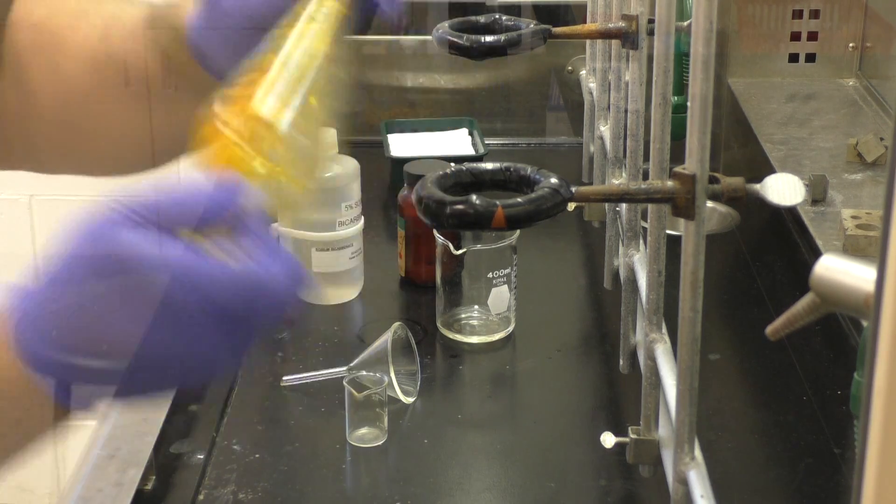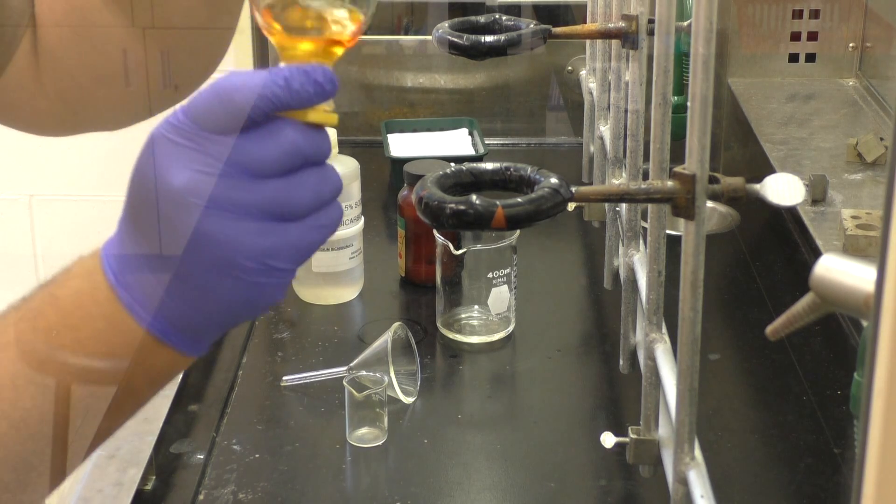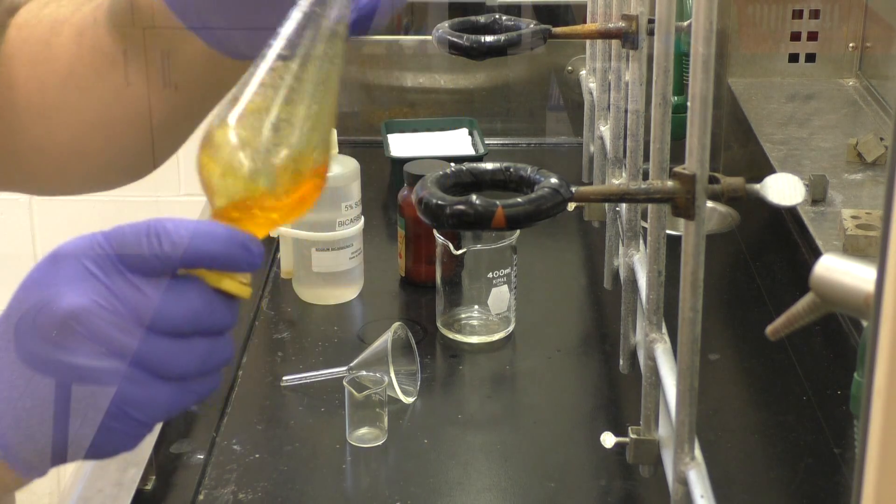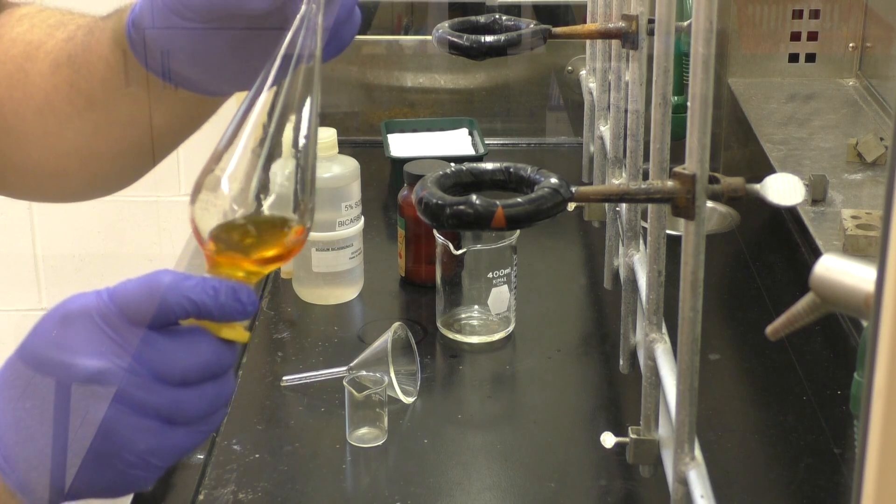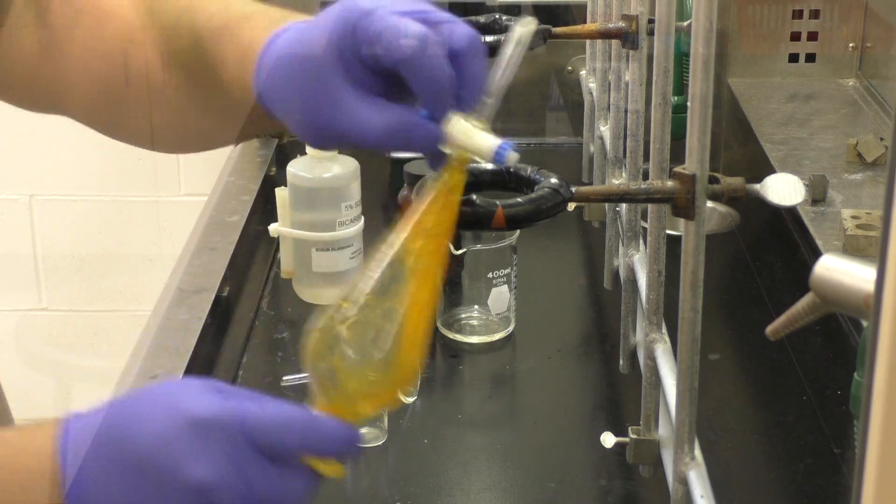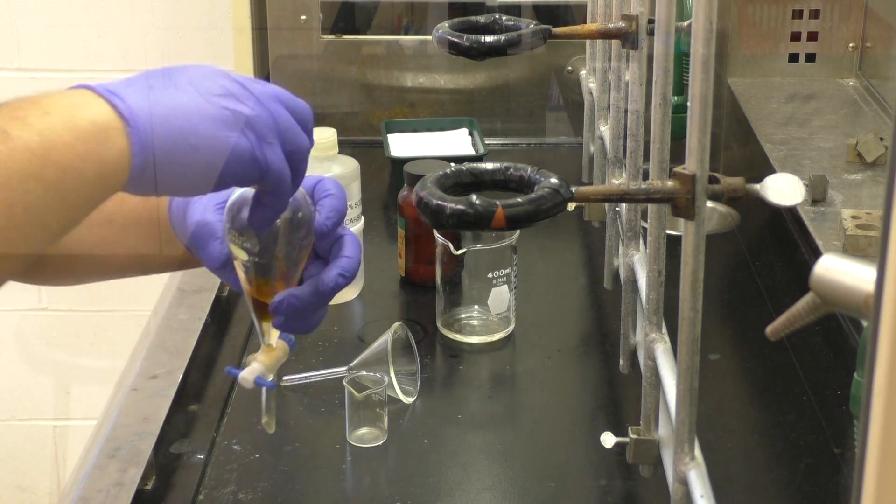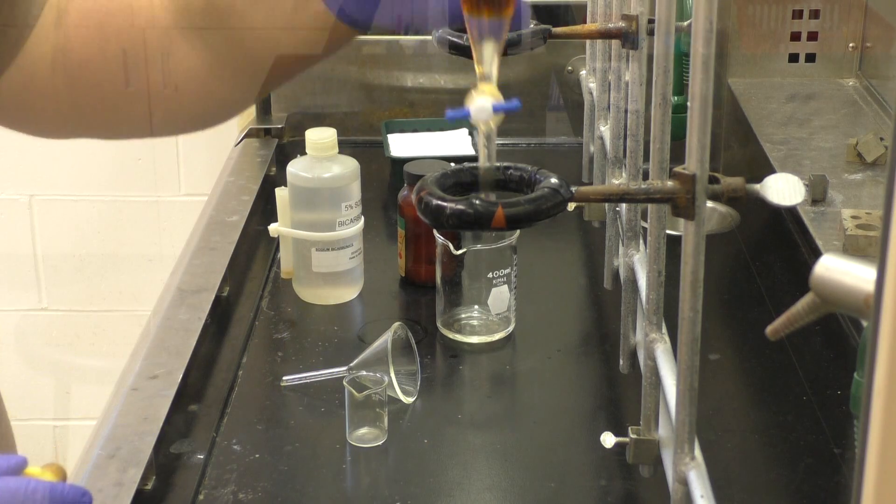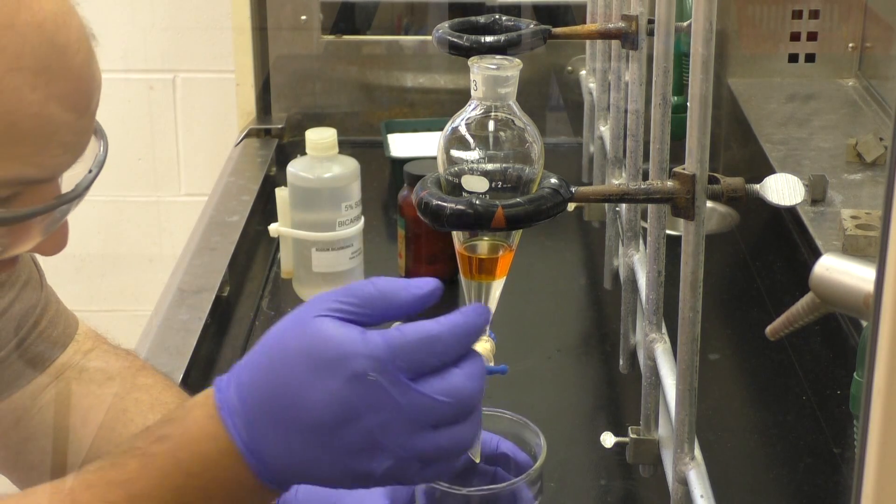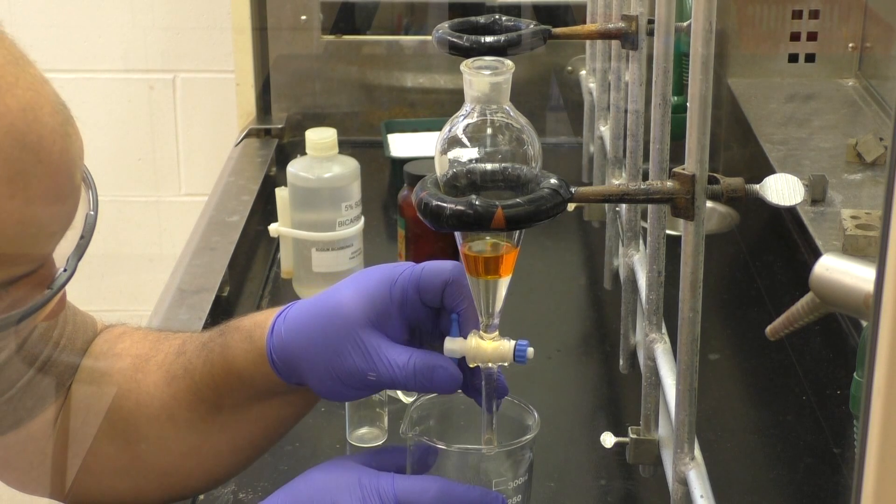And the other thing that you need to make sure is that you keep all of your layers until you're done. Until you get that final material, that solid material, or whatever it is you're looking for, keep everything you have. That's another thing that people will often do when you get to the end of the lab. Well, I didn't get anything. What do you mean you didn't get anything? I followed what it said. First of all, sure you did. I didn't get any solid material. First off, you didn't do what you were told to. Second, if you had everything, we could go back and get it. And when your next response is, oh, I threw it all away, that is a sign of just foolishness. Something where you're going to lose marks, because it was a dumb thing to do.